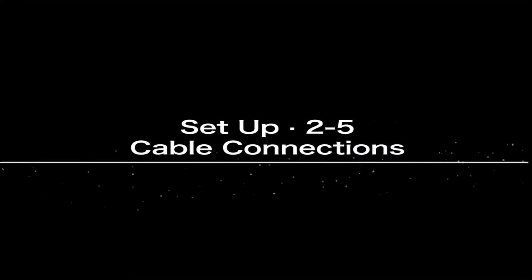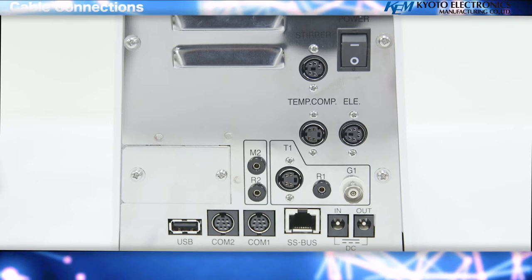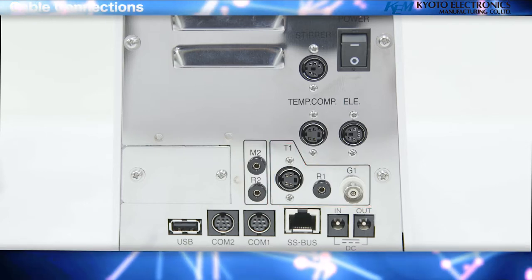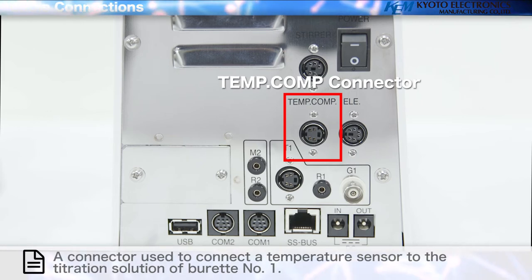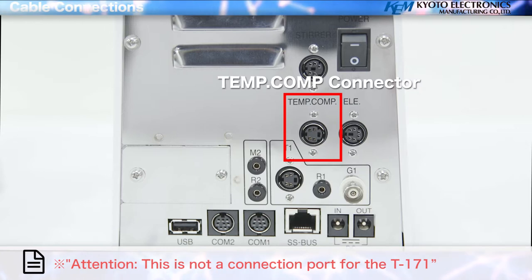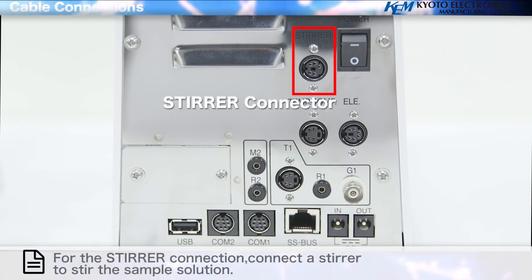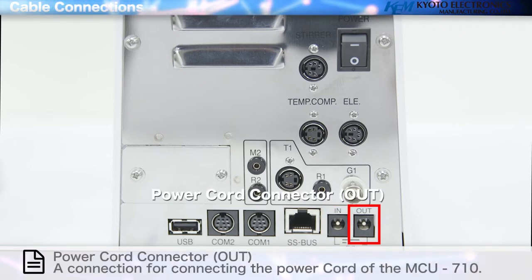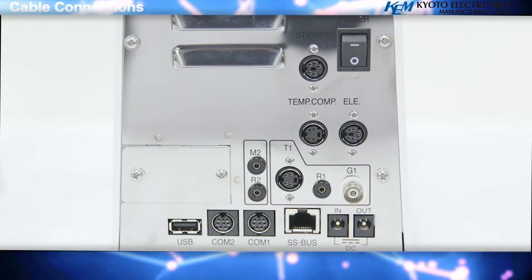Cable connections — description of each part. Pre-amplifier section detector one: a detector that measures the potential difference of the sample solution. Temp. comp connector: used to connect a temperature sensor to the titration solution of burette number one. Stir connection: connect a stirrer to stir the sample solution. Power cord connector in: a connection for the power cord. Power cord connector out: a connection for connecting the power cord of the MCU710.